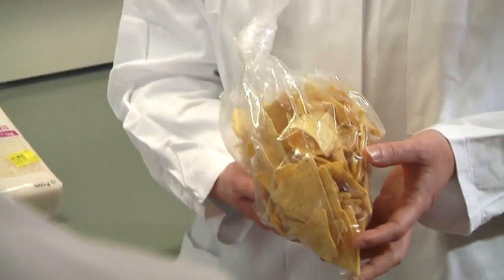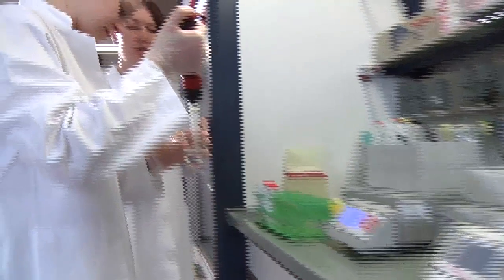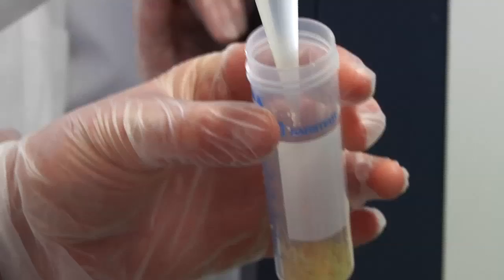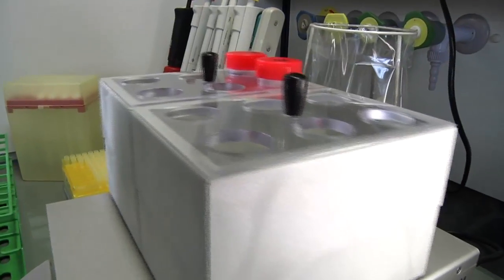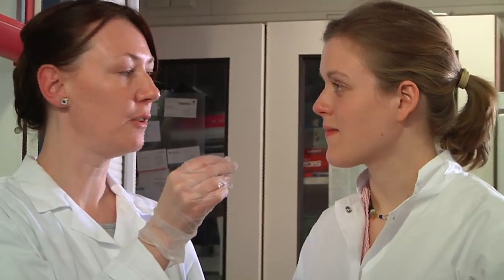We first have to grind the maize crisps into a fine powder to get the DNA. Here we've got our final cleaned-up DNA solution. We can now proceed to the next step and prepare the PCR.